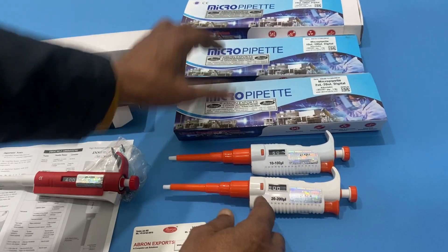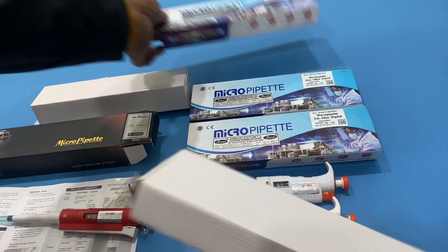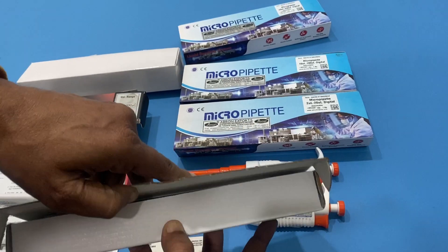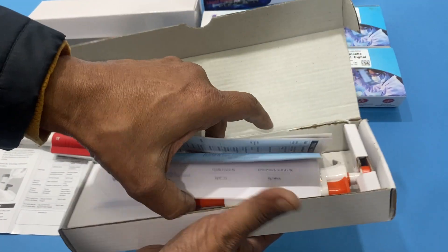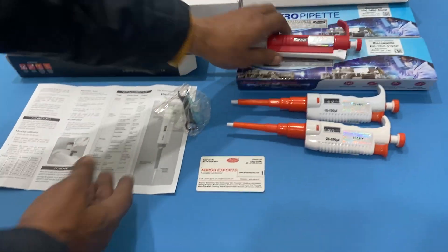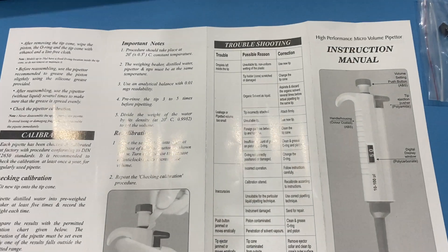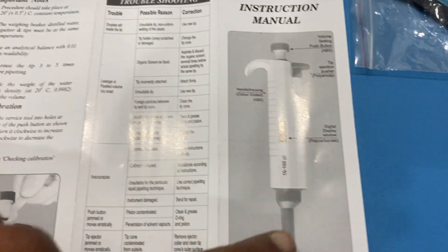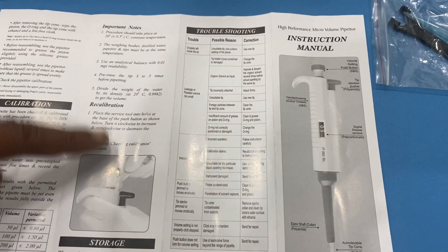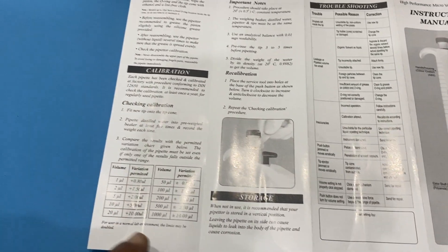There is another model — the 100 — and the packing comes in a different form. You take the packing, open it, slide it out. Every pipette comes with a manual with details showing the parts, how it is working, how it is made accurate. There are different models available.